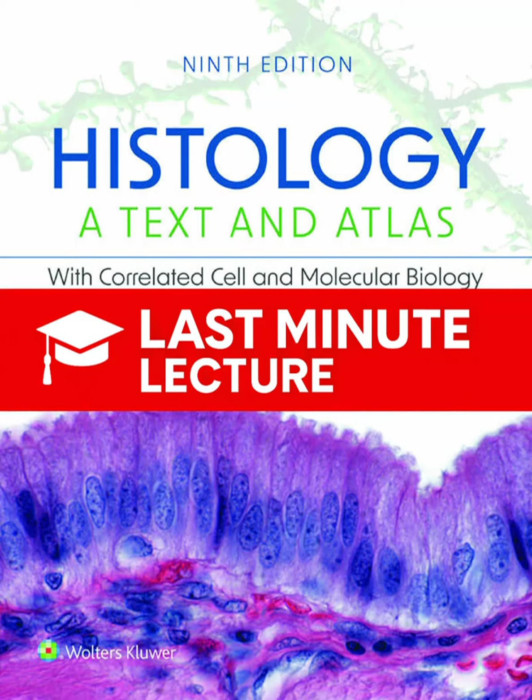Then there's dark field microscopy. Dark field uses a special stop in the condenser to block the direct light. It illuminates the specimen from the side, obliquely, so that only the light that's scattered or diffracted by structures actually makes it to the objective. So the specimen looks bright against a black background. Right. And this makes it perfect for detecting really small, fine particles that would be invisible in bright field, things like spirochetes, tiny crystals, or those silver grains we talked about in autoradiographs.